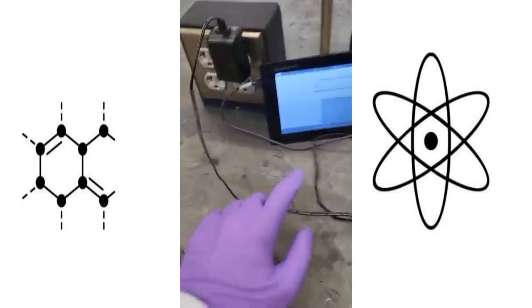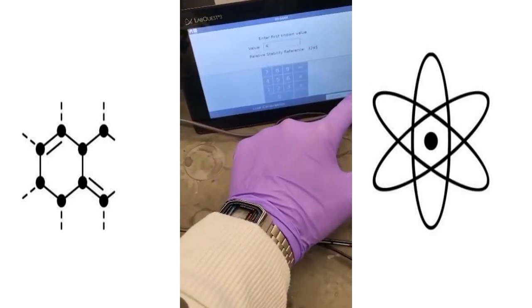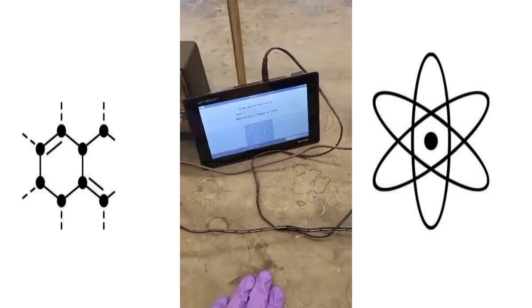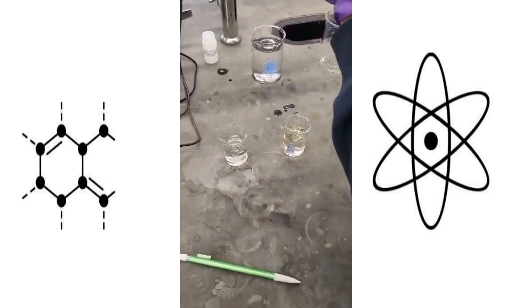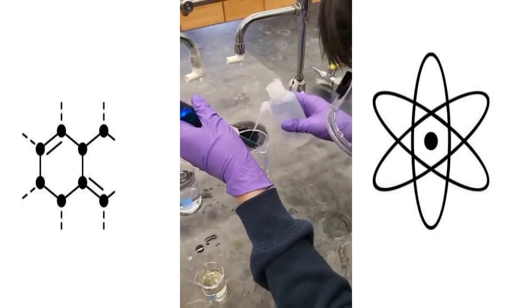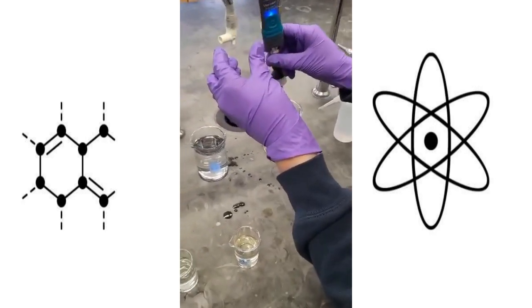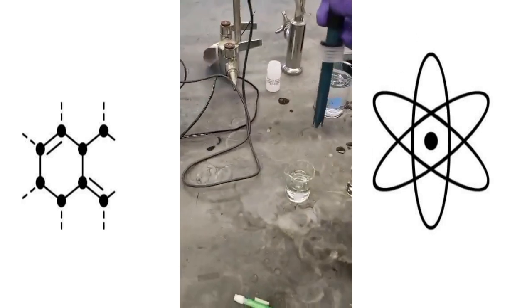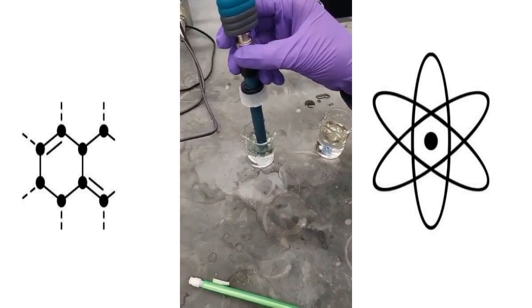Alright, we're going to go over here and touch 4 on the screen, and we're going to wait. Alright, now take it out of the 4. We're going to wash it off with our little spritzer. Okay. Awesome. Now we're going to put that into the 7. Leave it in there for a little bit.